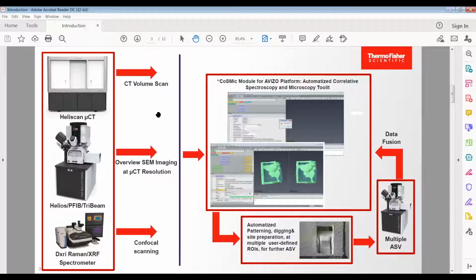At the beginning, we were doing the development for material science, and now we are extending it to life sciences. And this model goes hand in hand with a software-integrated cross-platform sample holder.